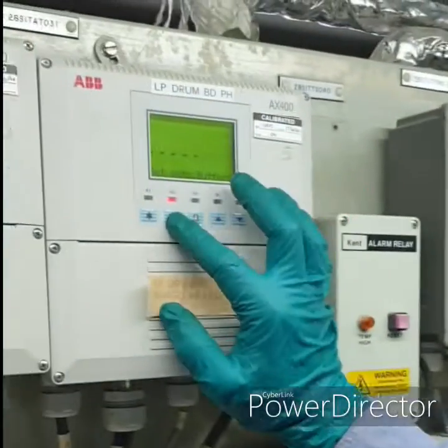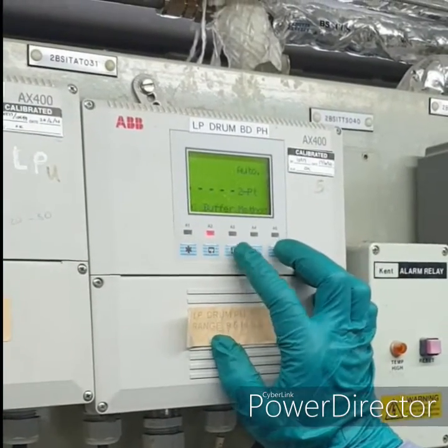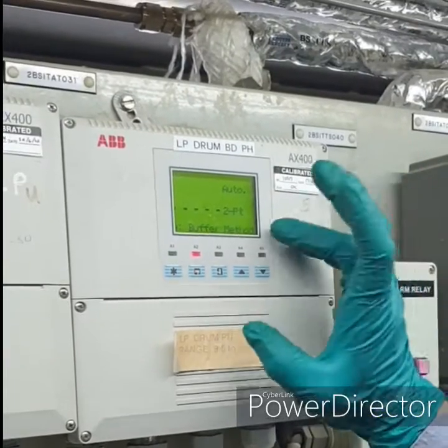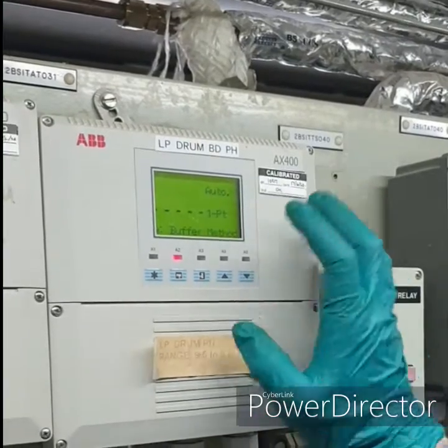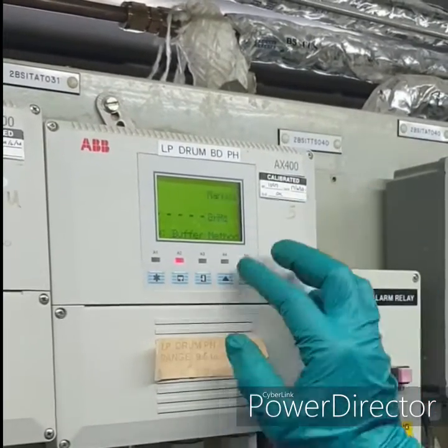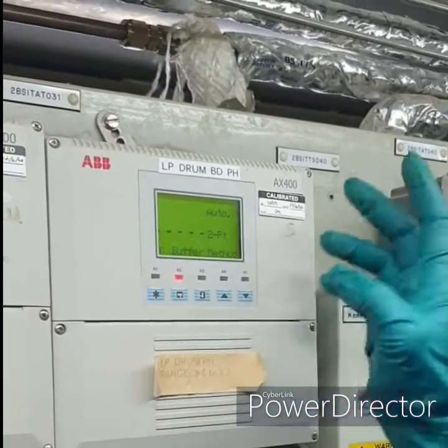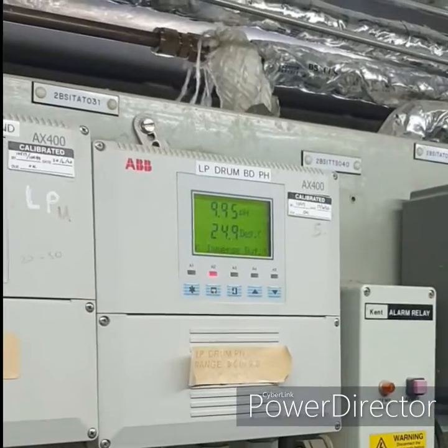Then we will go for calibration — sensor. We will perform 2-point calibration in auto. We could also perform 1-point, manual grab, or manual. At this time we will perform 2-point in auto. Confirm this, then it will start the process.